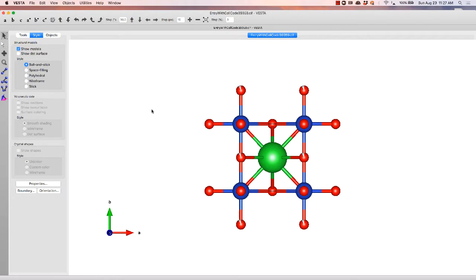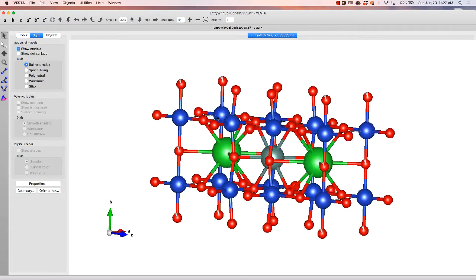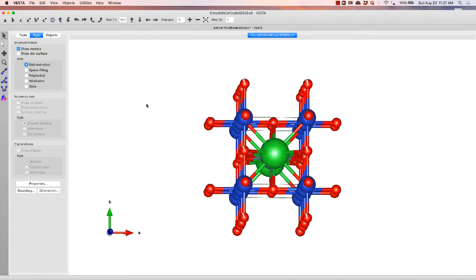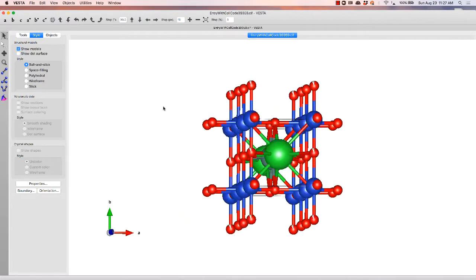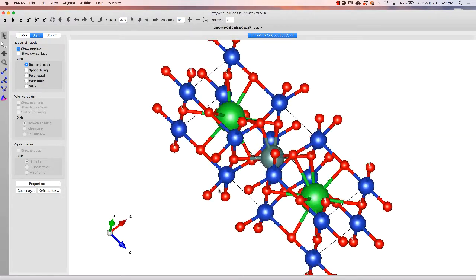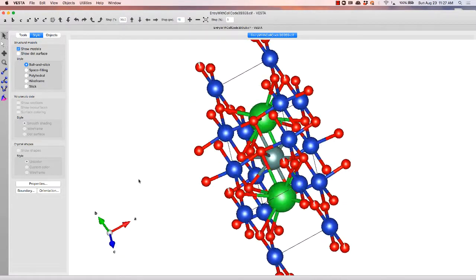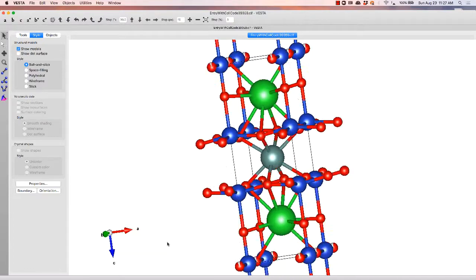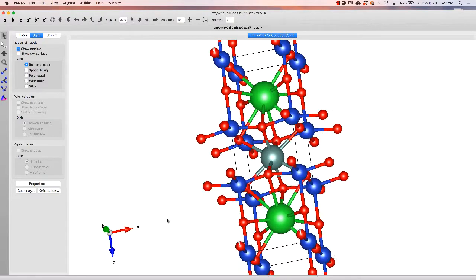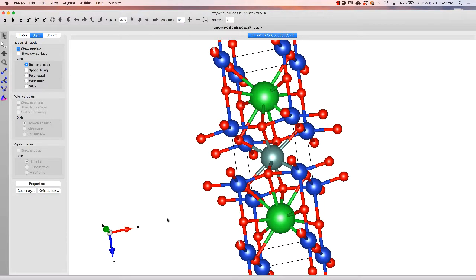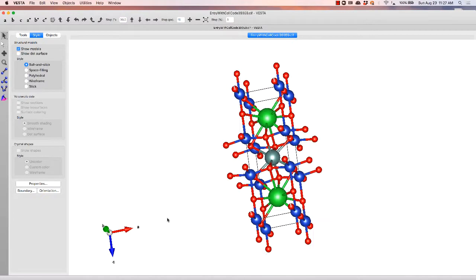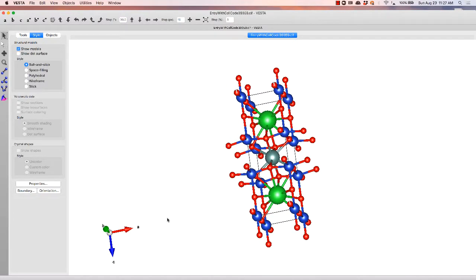although I never honestly use them because it's all about hotkeys when it comes to Vesta. So when you load it up, you're automatically in the rotate function, so you can take your unit cell and rotate it. If you ever fall out of that function, you can hit R to get back there.